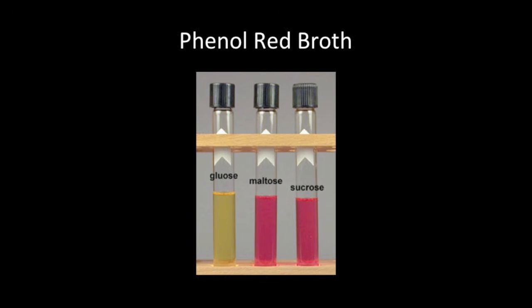So let's check your understanding. The same organism is incubated in each of the test tubes seen on the screen. Can you determine what the results mean? I'll give you a moment.